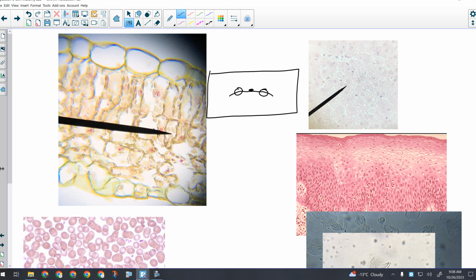In the animal cell, this is what you're going to see, depending on which one you get. The darker stained one is sometimes easier to see, but this is blown up a bit from what you will see. It kind of looks like when mud dries and cracks. That's the texture you're looking for, but the cells are quite a bit smaller. Each one of these circles would be a what? The nucleus. Each one of those circles is a nucleus.